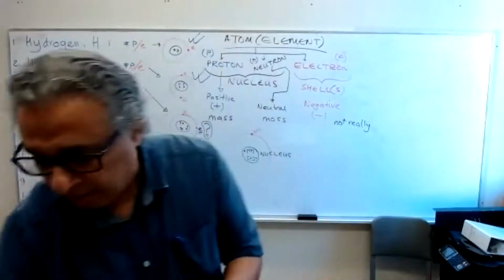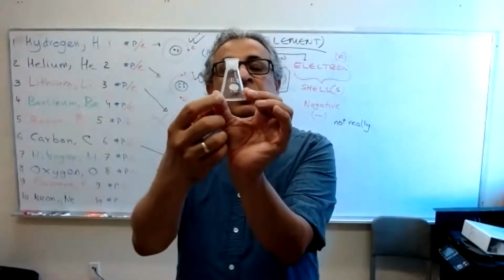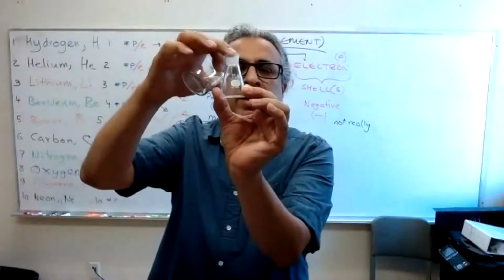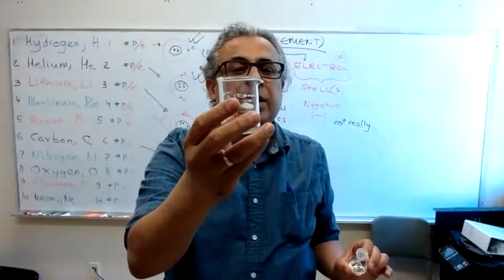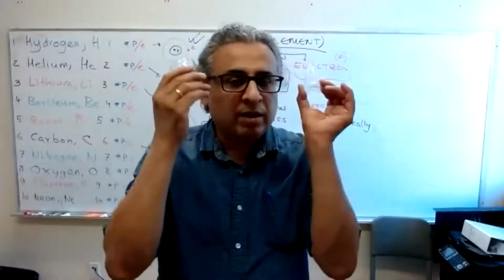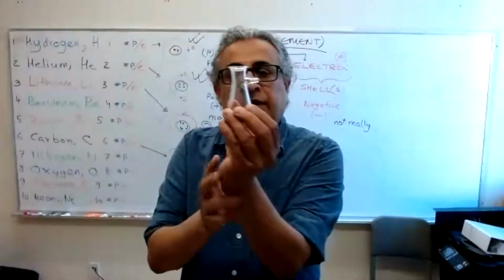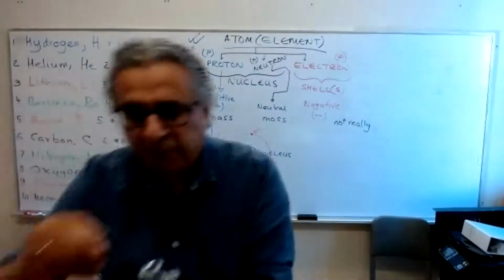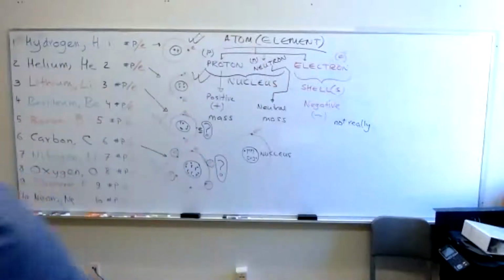That's a beaker. This is an Erlenmeyer. Erlenmeyers are good for doing crystallizations and stuff like that. They evaporate less, because the mouth, the upper end, is kind of tapered. Otherwise there will be faster evaporation. If you're just heating something up, or using some water or some solvent, you use beaker and Erlenmeyer in a judicious way. You have to make the right call. This is a filter flask. This is not an Erlenmeyer flask. This is a filter flask, because you can put a little rubber septum for good sealing and apply the vacuum here.